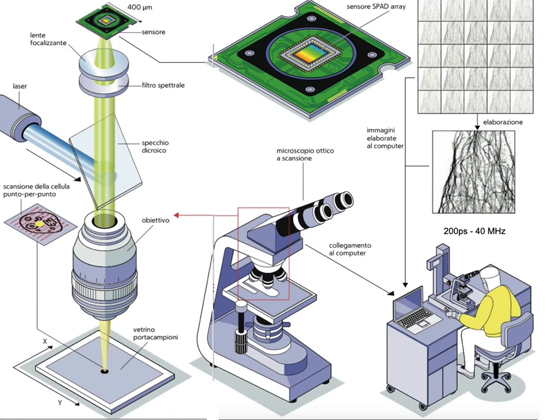You shine light, and usually what you do with a single point detector is like collecting light only from the central element of that matrix you see on the upper right side. But in our case, we collect information from all the other 25 points. And you could say, come on, information is shifted, is blurred, right? But we know the way it is shifted. It is, in case, distorted.